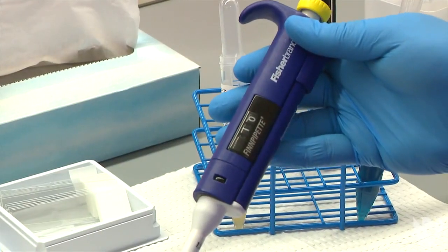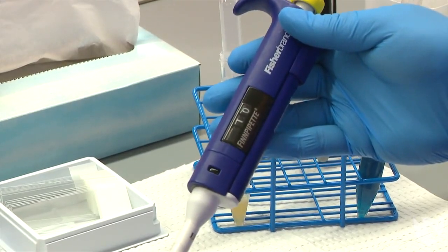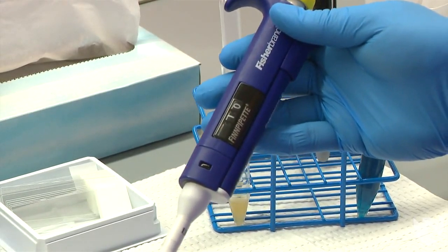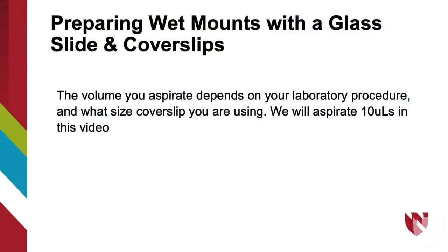Using a micropipette, we are going to aspirate 10 to 15 microliters of our urine sediment sample. The volume you aspirate depends on your laboratory procedure and what size cover slip you are using. We will aspirate 10 microliters in this video.